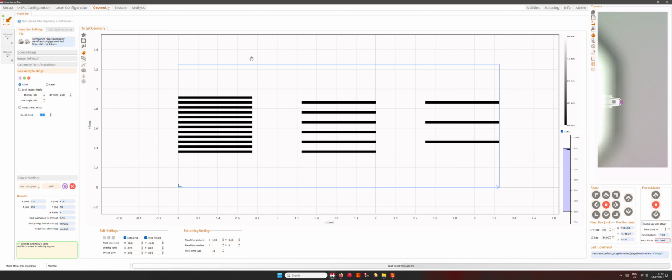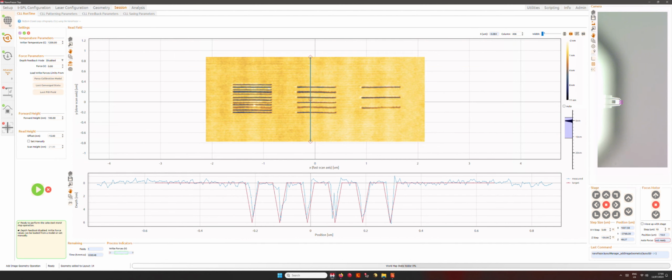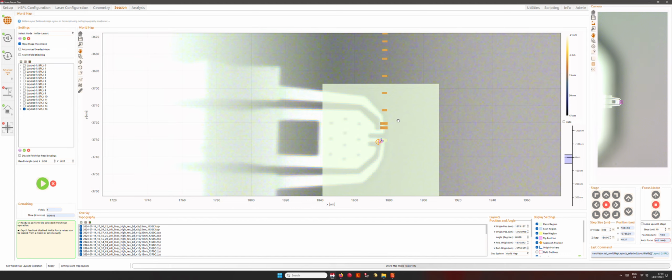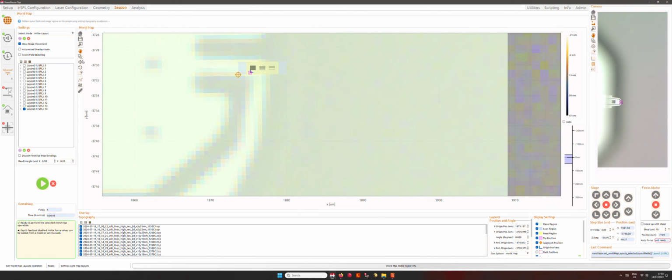So this is the design, the geometry that I import. We have already quite some geometry, so we see that it's number 14, the one that I just imported. And so we can go and select this design and place it here. Very well.